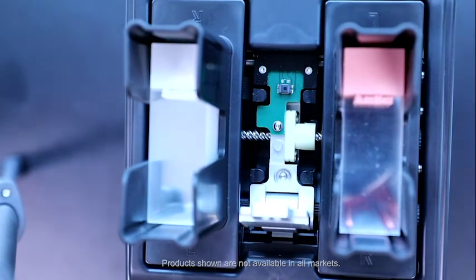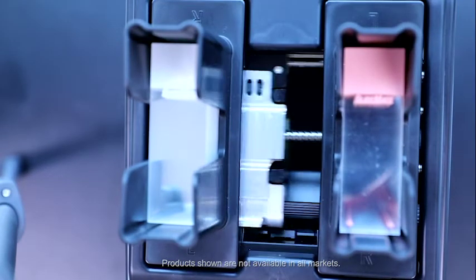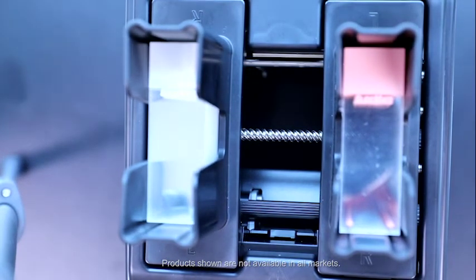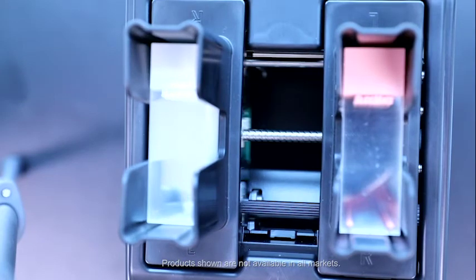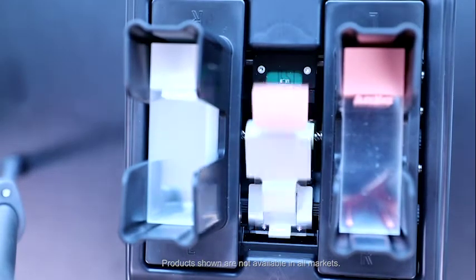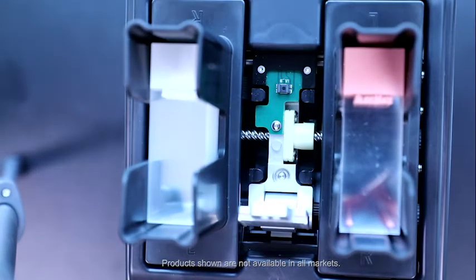The SlideMate Pro's Intelligent Slide Selection System can be programmed to automatically select the correct hopper to dispense the type of slide needed for each application.